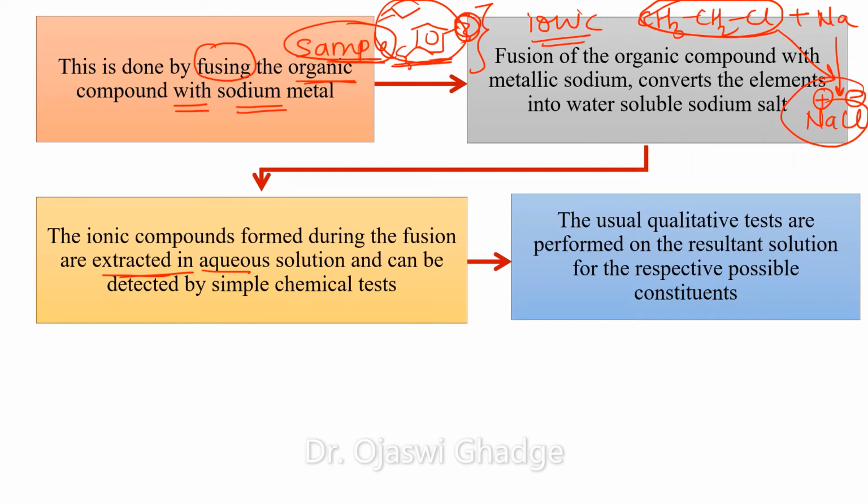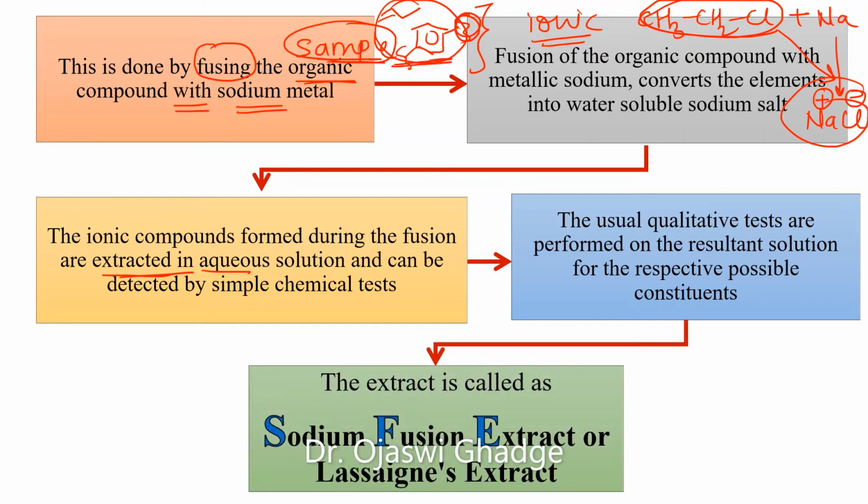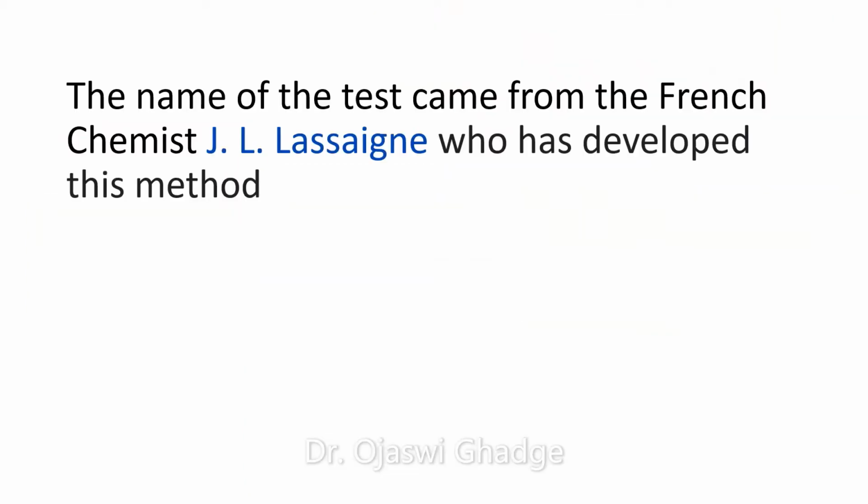The usual qualitative tests are performed on the resultant solution for the respective possible constituents, and this extract is called sodium fusion extract, or it is also called Lassaigne's extract. The name of the test came from the French chemist J. L. Lassaigne, who developed this method.